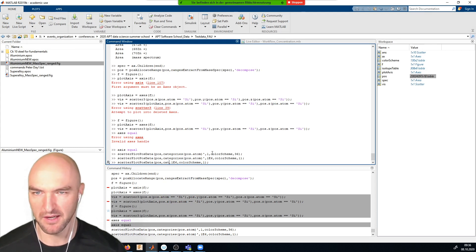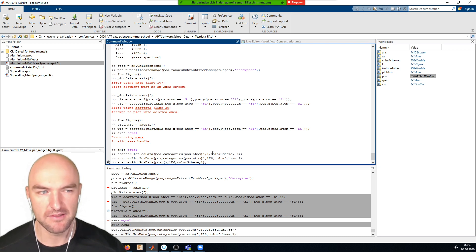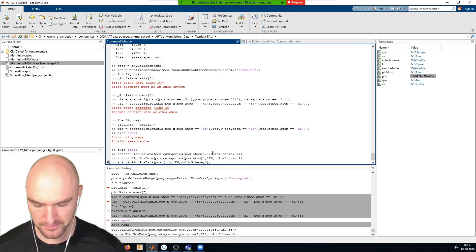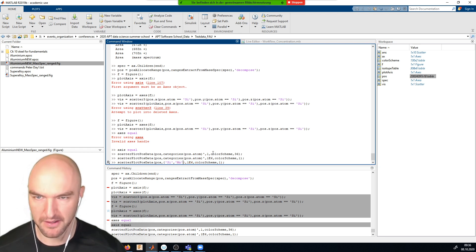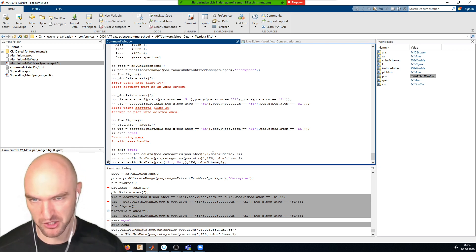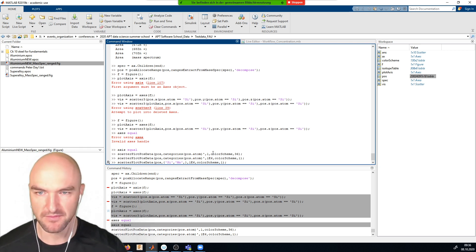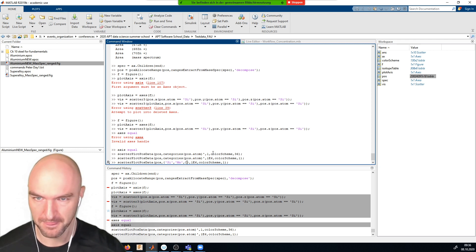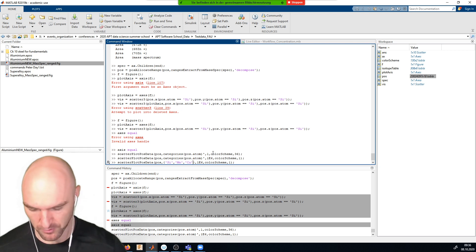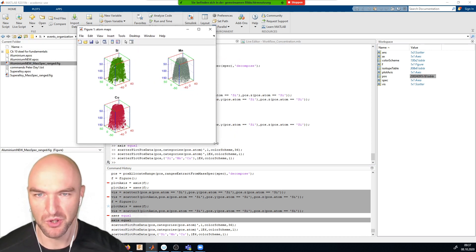I'll redo that with a cell array of specific elements: silicon, manganese, copper. The order matters — especially for publications where you may want elements in a specific order. Silicon, manganese, copper — let's stick with those three for now.